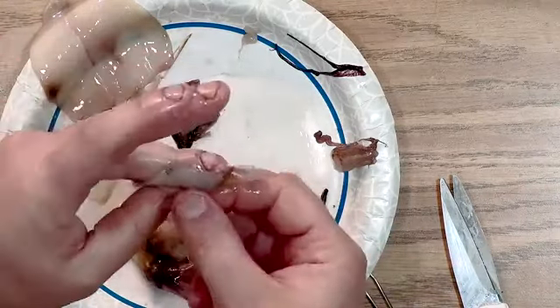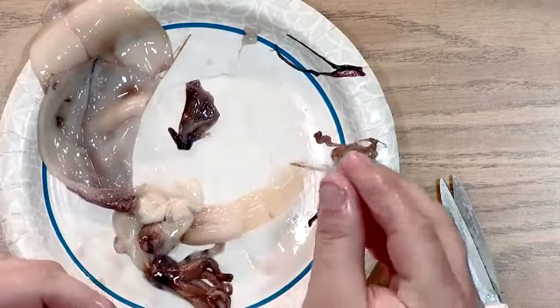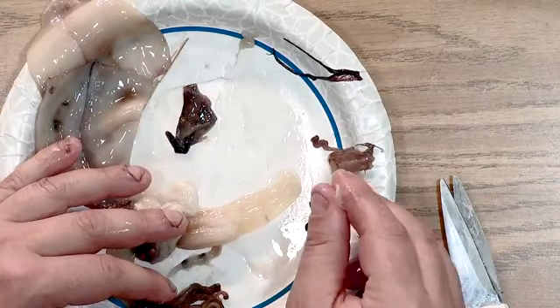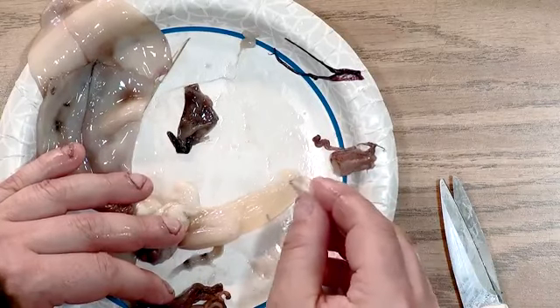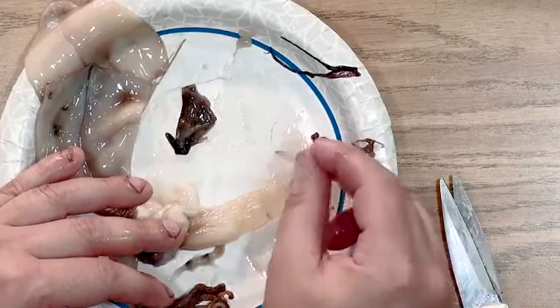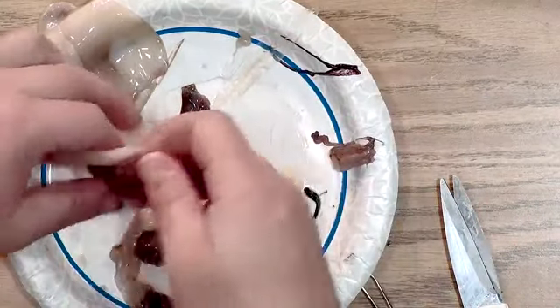And I'm going to take the pen out. Now I could actually use this shell or this pen to poke into that ink. Notice it's kind of like a pen shape. And I could poke into that ink and try to write something. Oh, see that? I was able to make that mark from the ink with my pen. That's pretty awesome.